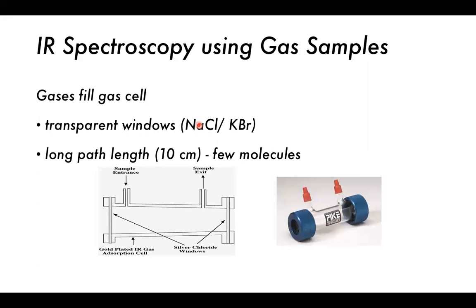It needs to be very dry, not too dry, but very low humidity. Often these FTIR spectrometers have very well dehumidified casings, with a cartridge of silica beads which needs to be replaced regularly in order to maintain a super dry environment inside, so that the transparent windows don't get destroyed by atmospheric water. Now, of course, a little bit of water is not a big deal.